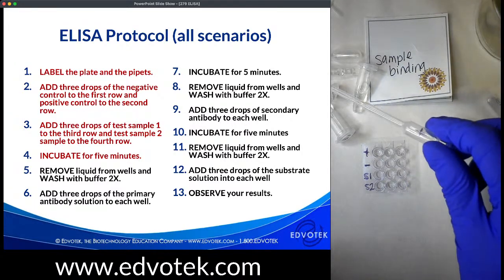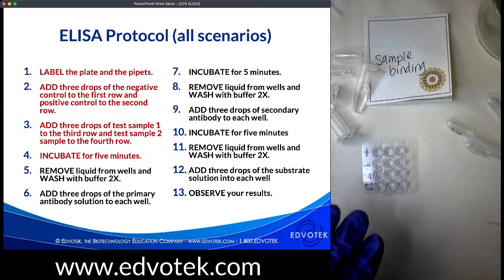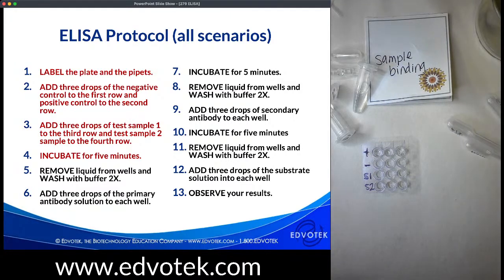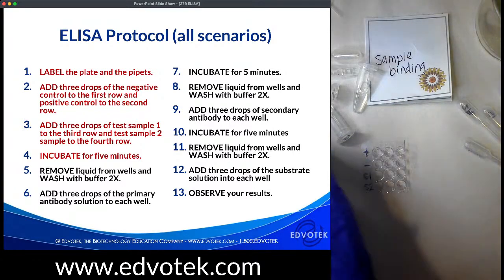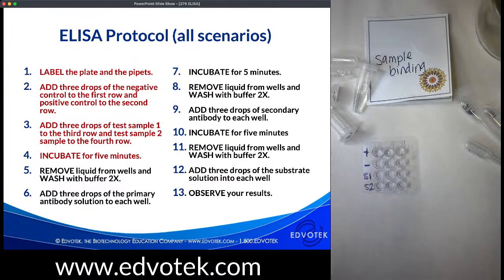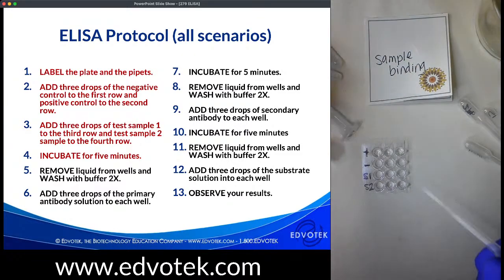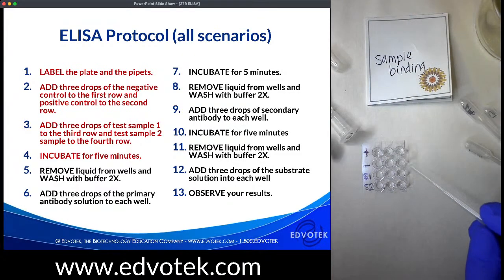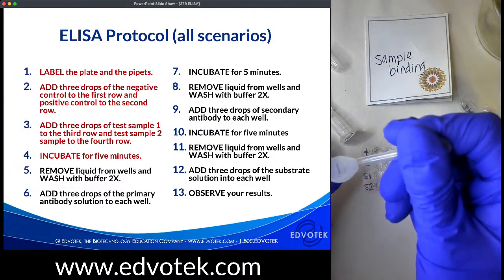We will keep this sample to... remove the liquid now from our positive wells. And each one of these wells is almost like an individual... okay, that's my positive. Where's my minus? Here it is. There they are. Each of these little wells is almost like its own little test tube. So we are actually going to be performing 12 separate ELISAs over the course of this experiment. And so this is our negative control sample.